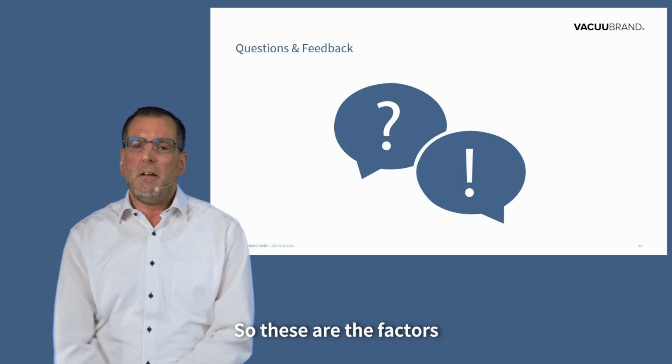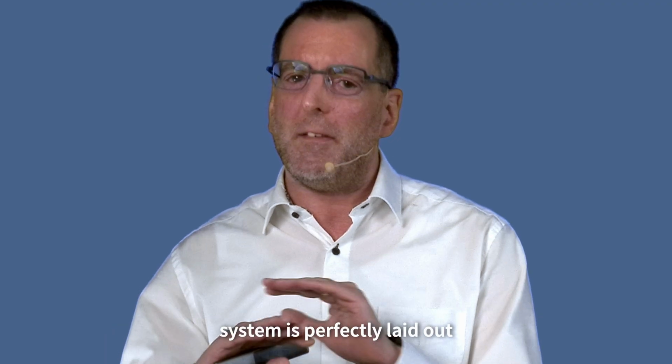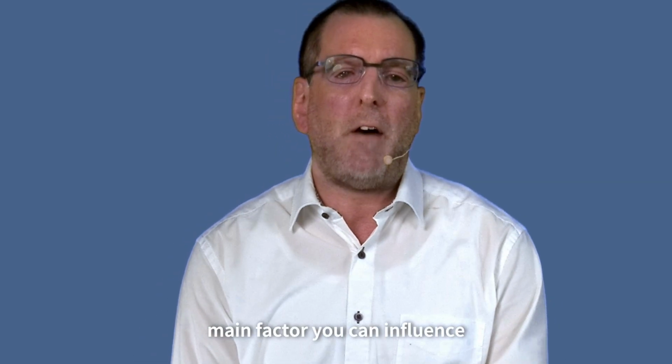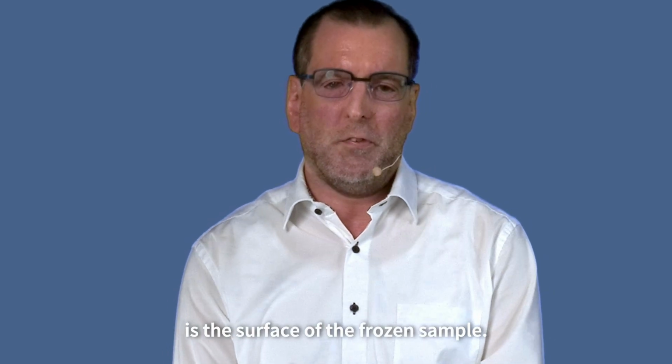So these are the factors that you can play with, but at the end of the day, once your system is perfectly laid out to your sample and drying media, then the main factor you can influence is the surface of the frozen sample.